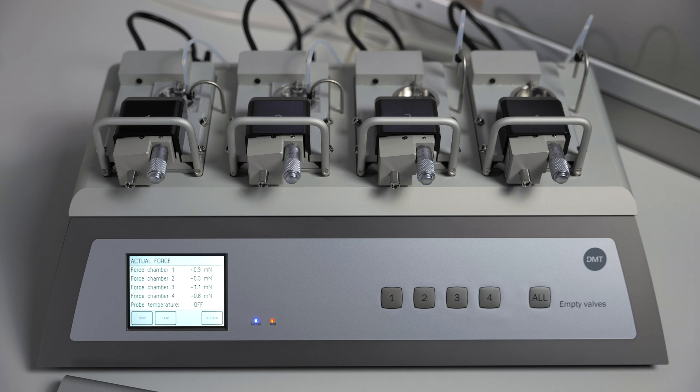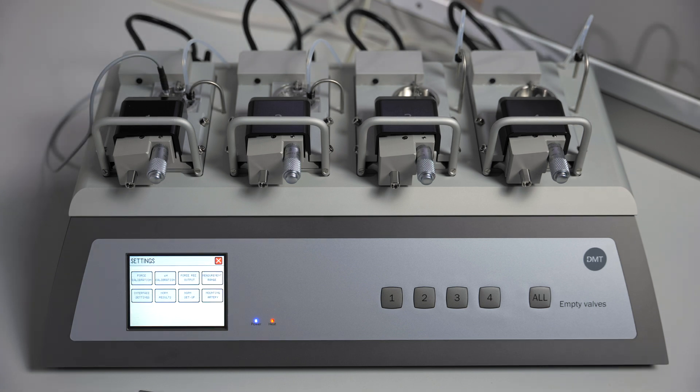You should then give your vessels 20 minutes to reach the correct temperature before using the normalization. In order to utilize the 630MA's automated normalization, you will need to do setup in the 630's menus.